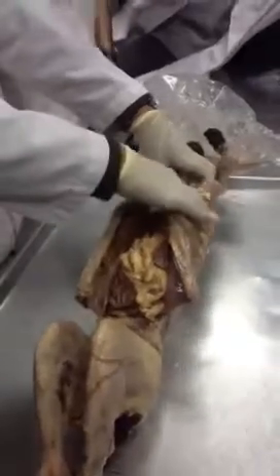We have actually dissected almost everything we need to see. Previously we dissected the abdomen, and we also dissected the thorax later on. In the thorax you understand that there are two main things: two lungs, one on each side, and in the middle, which is called the mediastinum, we have the heart. I asked you beforehand to know about the coverings of the heart and other things, and you did that. But let's talk about the lungs this time.